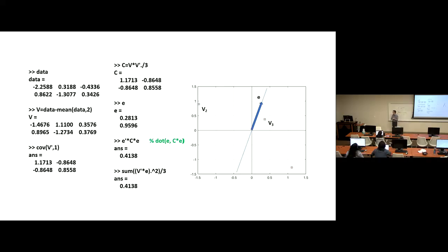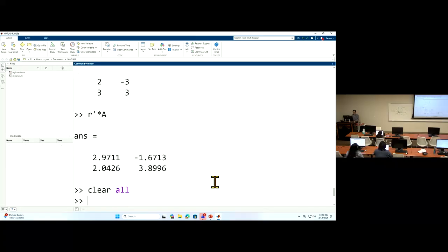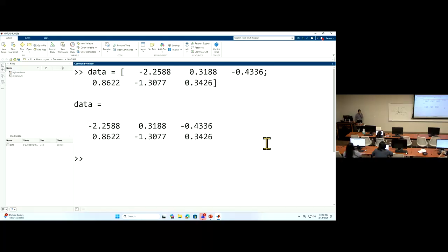So what I will do, I will type this data in, 3 points. Okay, I have 3 points in the space.